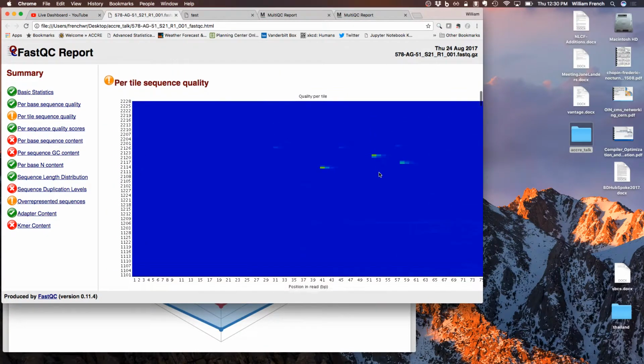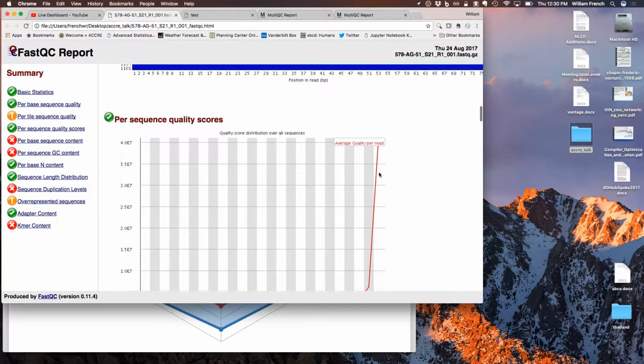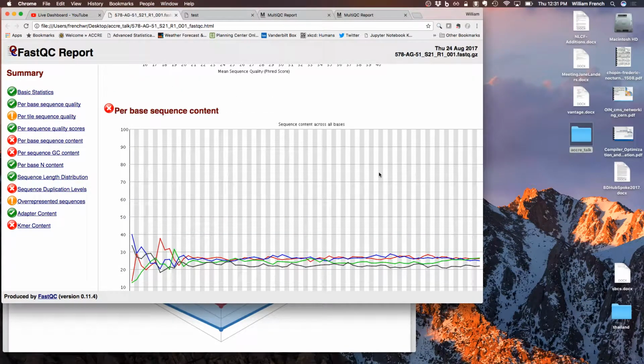And then there's a bunch of other information here that can be very useful. All right, so this is a failure because each of these is A, T, C, and G, and we'd expect about 25%. There's a decided non-randomness to the 5' end. This is RNA sequencing, and so even though it says it fails, it didn't. This is what you expect for RNA. We random prime our RNA, and random primers are not random. And so we have sequence bias at the 5' end that then eventually smooths out. So you have to be careful with QC, right? Not everything that says it's a failure is a failure. You have to know what you're sequencing.